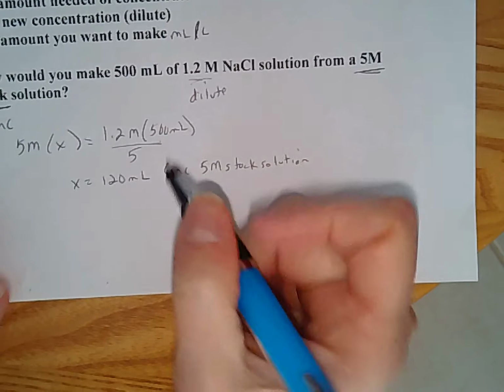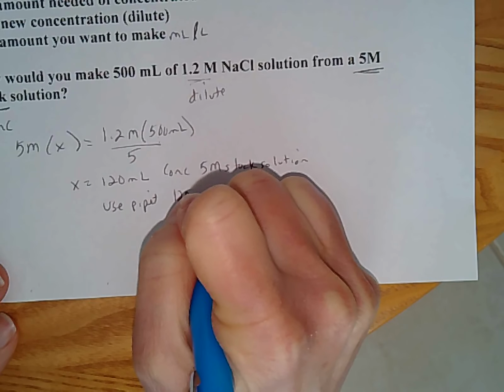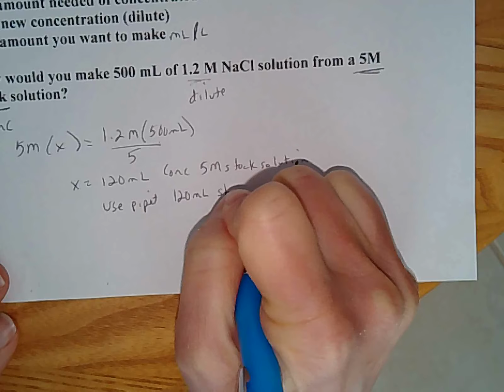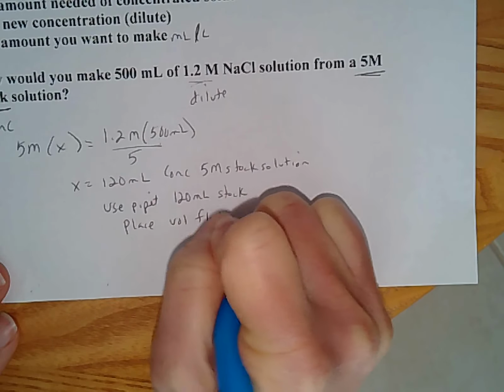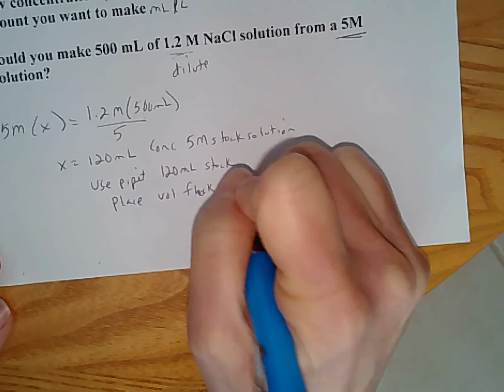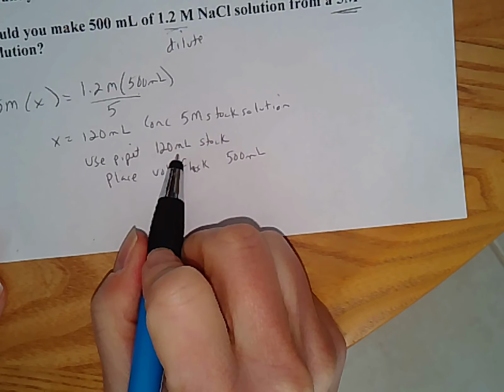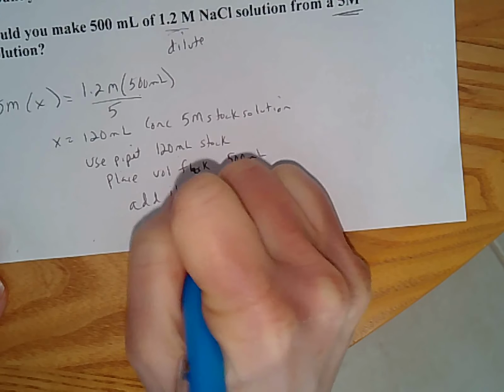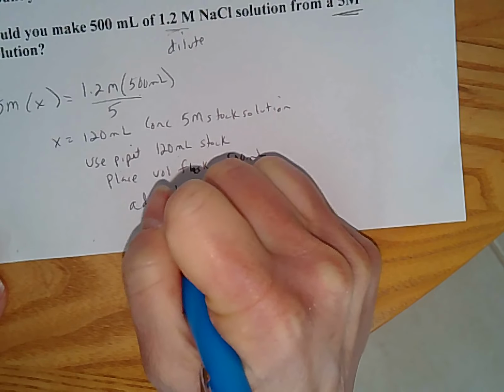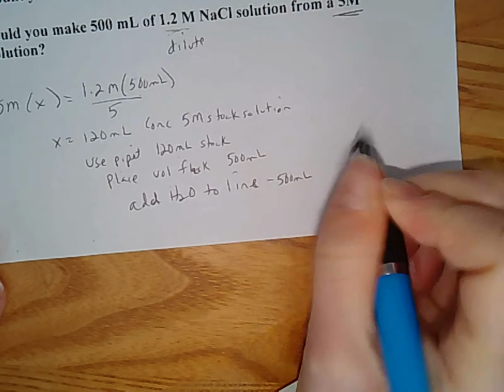So if I go back to my problem here, I'm going to use a pipette and extract essentially 120 mils of that stock solution. And then I'm going to place it into a volumetric flask of about 500 mils. And then I'm not done at that point. So I'm taking the stock and putting it into the volumetric flask. And then I'm going to add water to the line. So the line is going to be exactly 500 mils.